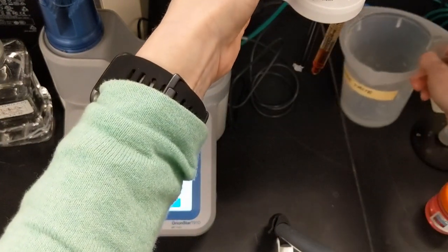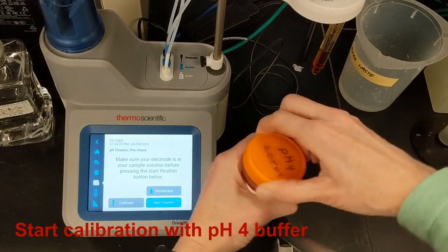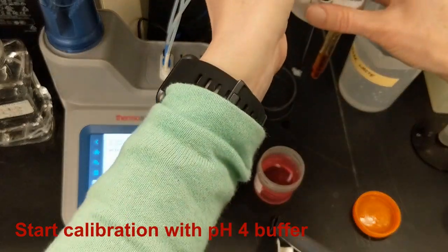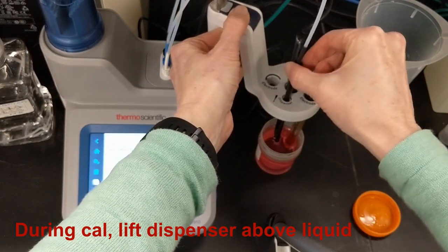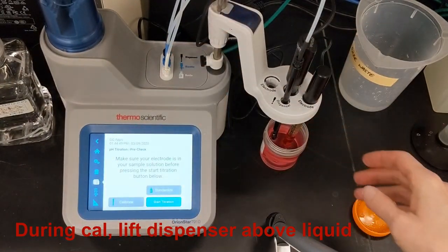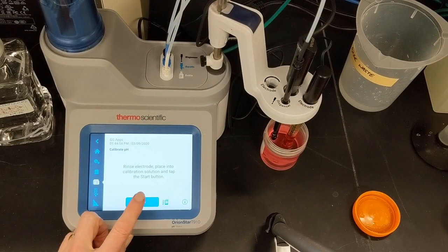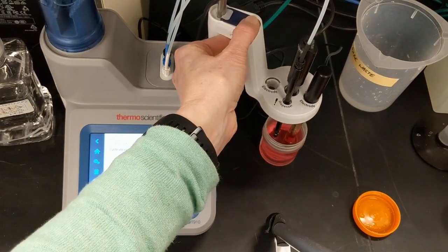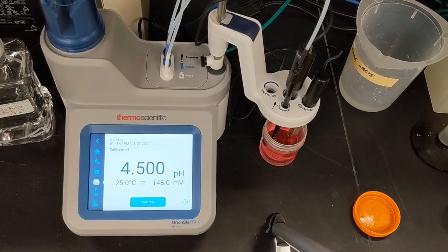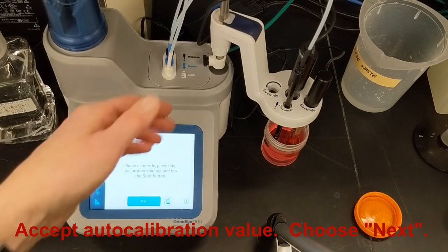Now I can start the calibration with Orion pH 4 buffer. Each day, I pour a fresh portion for the day's calibration. During the calibration, I'll lift the dispenser above the liquid so that there's no cross-contamination. To get the calibration started, I select the calibration option and touch Start. The meter reads the pH, automatically identifies the correct buffer, and waits for a stable reading. When the AutoCal value appears, I accept the value and choose Next to continue the calibration.